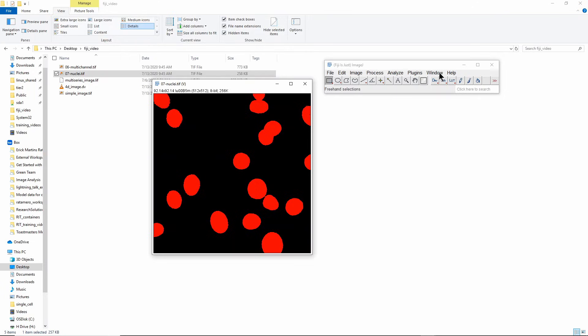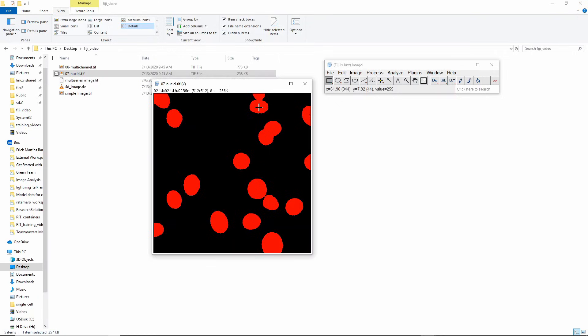Now if you look here in this bottom bar in Fiji when I go over the image, you will see that the background values are all zero and the foreground values are all 255, so that means I only have foreground and background, which means this is a binary image and the binary image is the result of a segmentation.